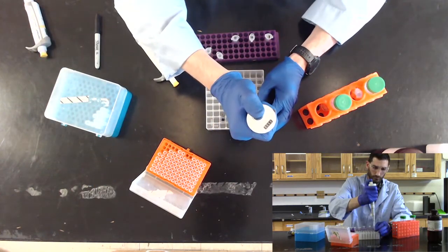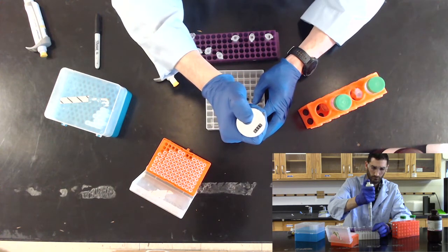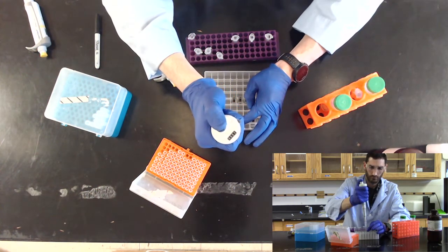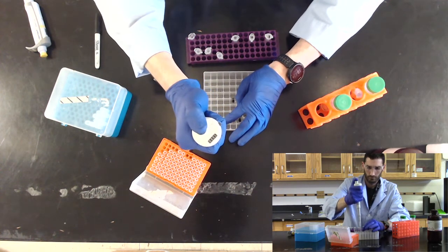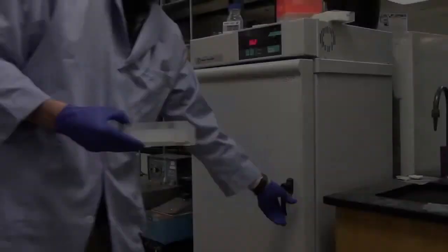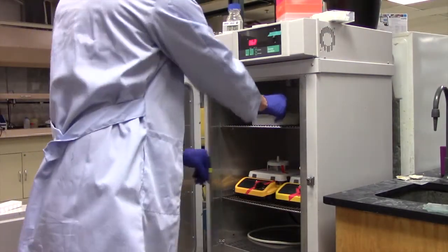Thoroughly mix your Bradford reagent and protein solution by pipetting up and down several times in each cuvette. Alternatively, you can use parafilm to seal the top and turn the cuvette over once or twice. Incubate the mixtures at 37 degrees for 10 minutes.